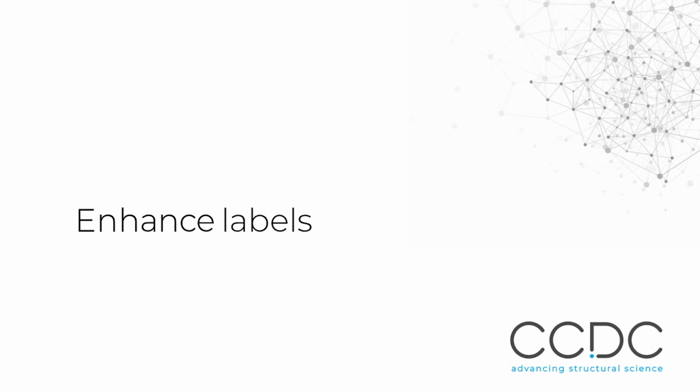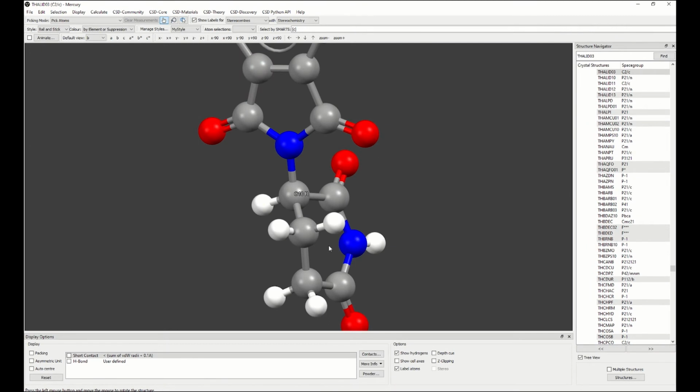We will now see more options to display labels and enhance their appearance to make them more readable. We are back to our thalidomide structure, and we have selected to show labels for stereocentres with stereochemistry. We might be interested in labelling all the atoms connected to the stereocentre. To do so, we can use Toggle Labels. We go to picking mode at the top left, and in the drop-down menu select Toggle Labels. Then, click on the atoms for which we want to turn on the label, which are the four directly connected to the stereocentre. If the label is on, clicking on these atoms while using Toggle Labels mode will turn them off.